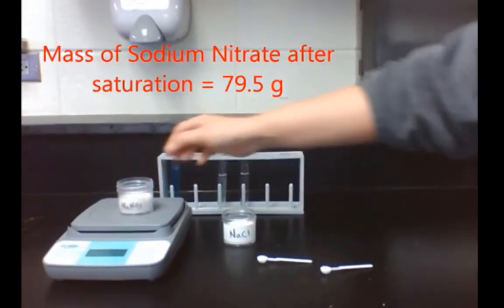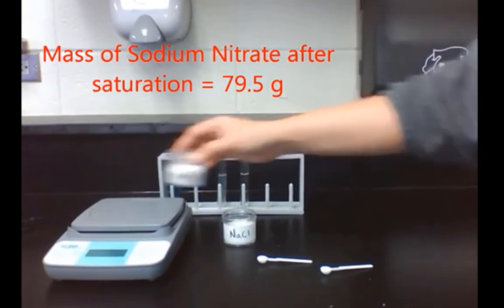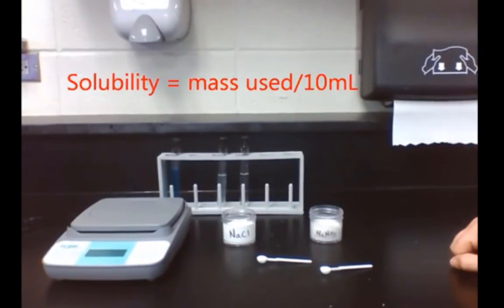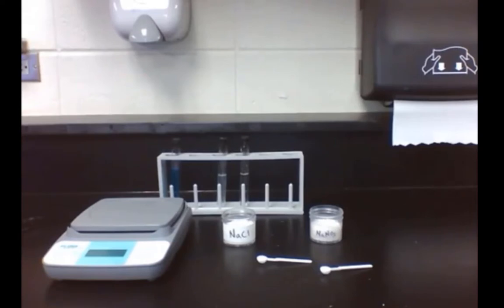After completing the lab, students will notice that different types of matter do not dissolve equally in water. Because solubility is a characteristic property of matter, like density and reaction to heat, it can help to identify different substances. Also, students will know that if they are not careful when conducting lab, experimental errors might occur.